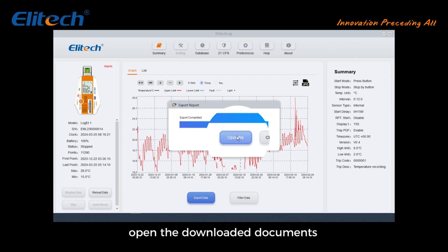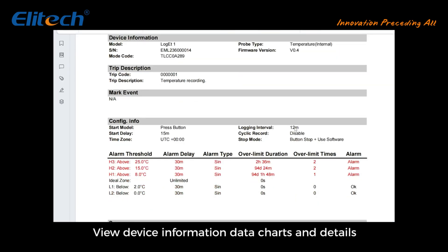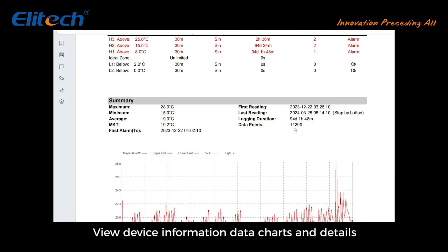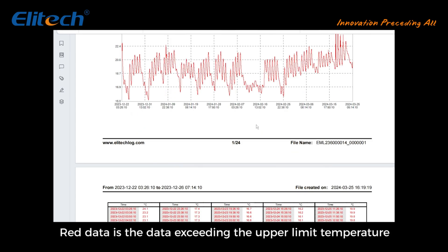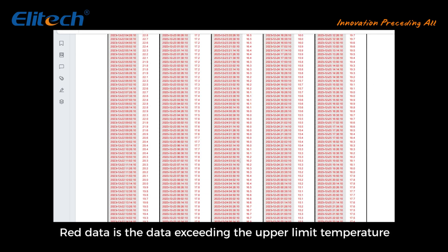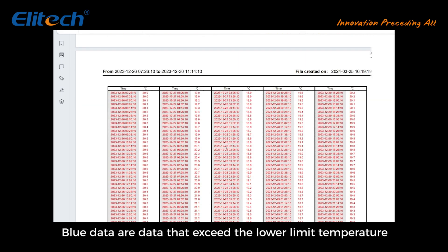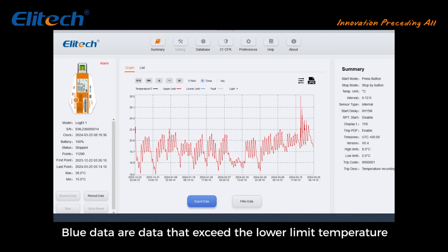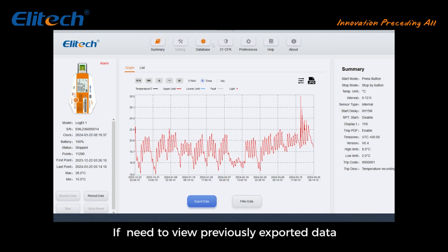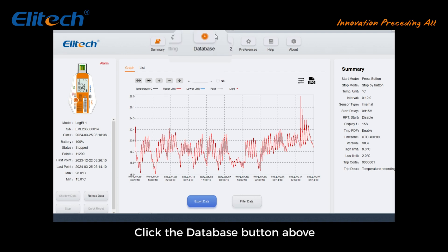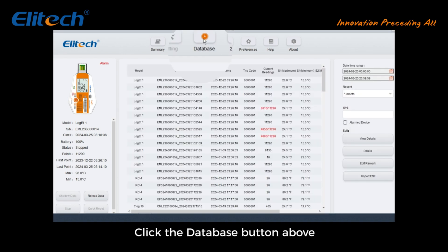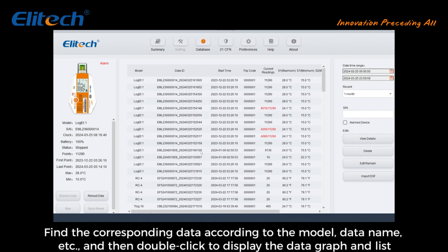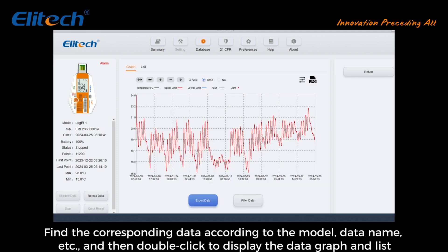Open the downloaded documents to view device information, data charts, and details. Red data indicates data exceeding the upper limit temperature; blue data indicates data exceeding the lower limit temperature. If you need to view previously exported data, click the database button above and find the corresponding data according to the model, data name, etc., then double click to display the data graph and list.